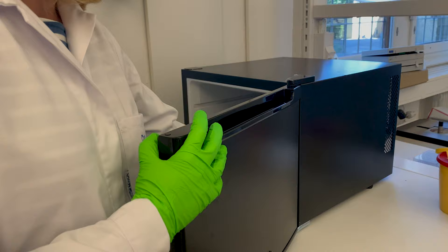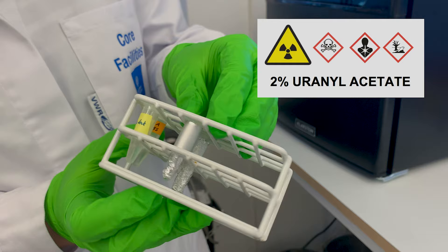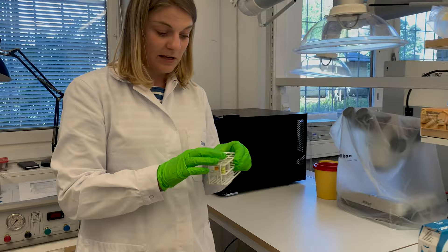For the negative staining we typically start with uranyl acetate 2% stock solution, which is filtered and stored in these little tubes in the fridge, protected with aluminium foil as they are very light sensitive. The solution will precipitate when exposed to light.